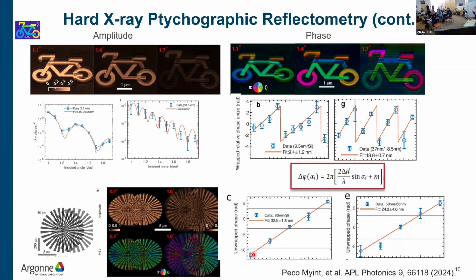When the beam comes back, we're going to do more experiments here. I can tell you that although we were not able to resolve the 50 nanometer thickness, if we use this relative phase method, we can tell the height of all the different parts of the pattern.